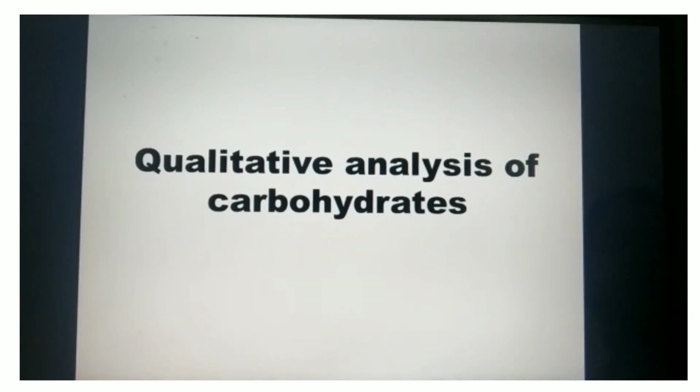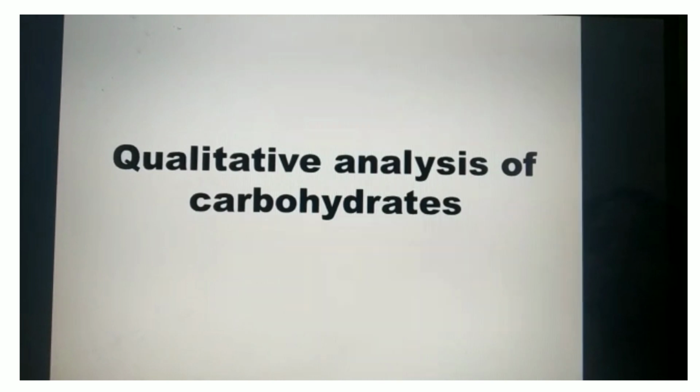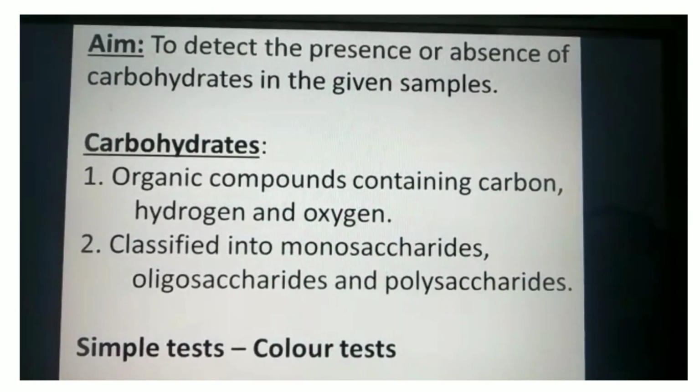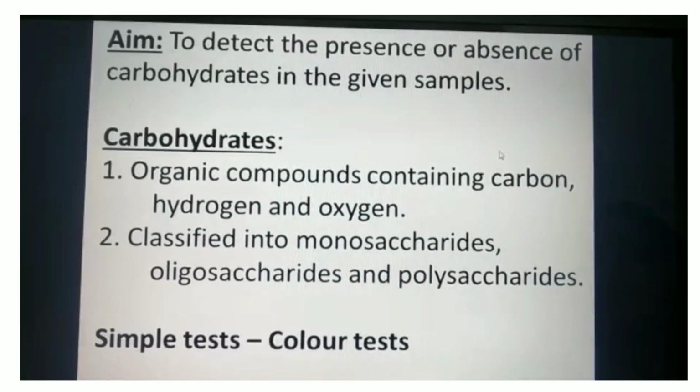Good morning. Today we will do a practical on qualitative analysis of carbohydrates. The aim of this practical is to detect the presence or absence of carbohydrates in the given sample.